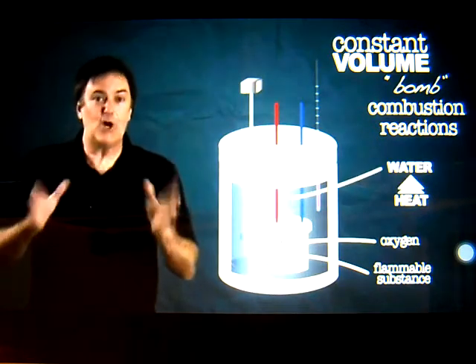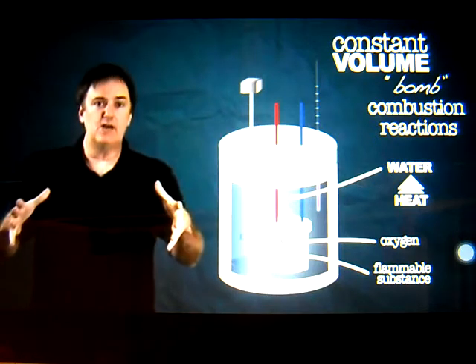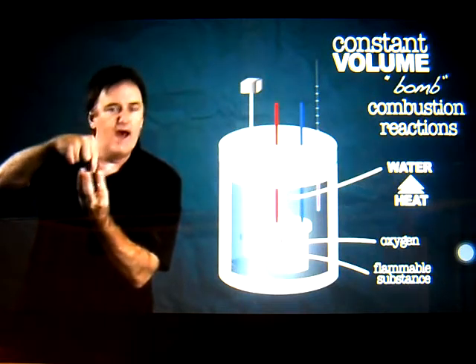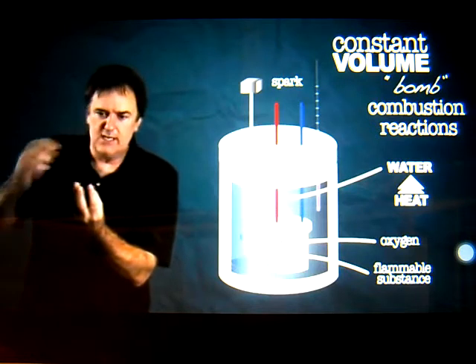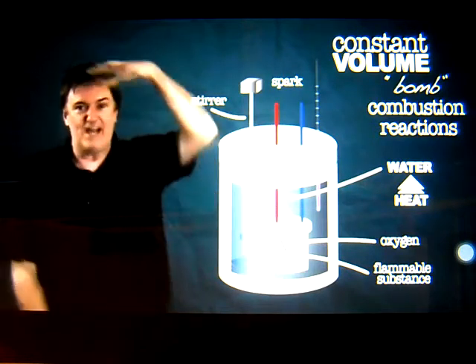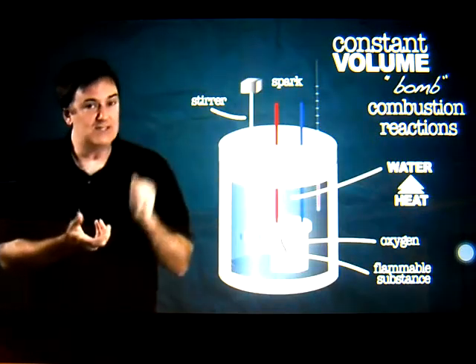Only problem is it's going to cost you a little more this time, because now you need a big container of water, you need the stainless steel bomb, you need something to spark inside the bomb, basically a spark plug, you need wires on it coming out, you need a stir bar, you need all that apparatus hooked together. Oh yeah, an oxygen tank, you've got to put the oxygen into the bomb.